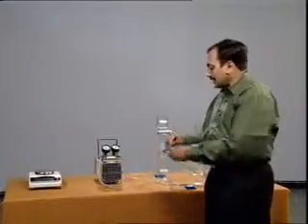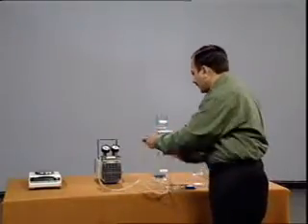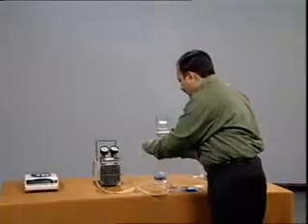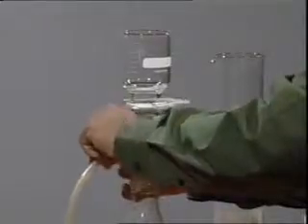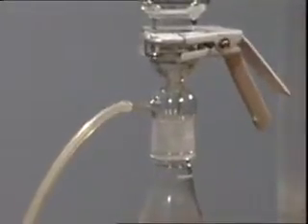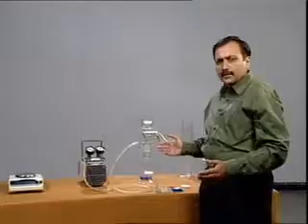Now, connect the silicon tube of the pump. Now, the assembly is ready for measurement.